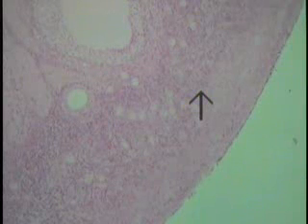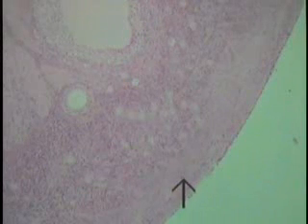To help in this endeavor, examine a section of the ovary. The ovary contains extraordinarily large cells referred to as ova. This is a section of the ovary. This is the external boundary of the ovary on this particular section, located at and indicated by the arrow.